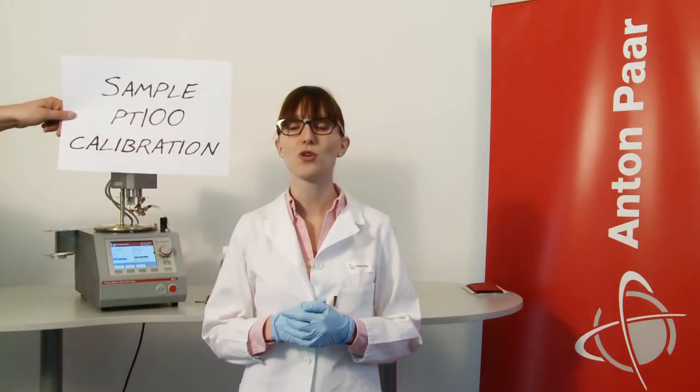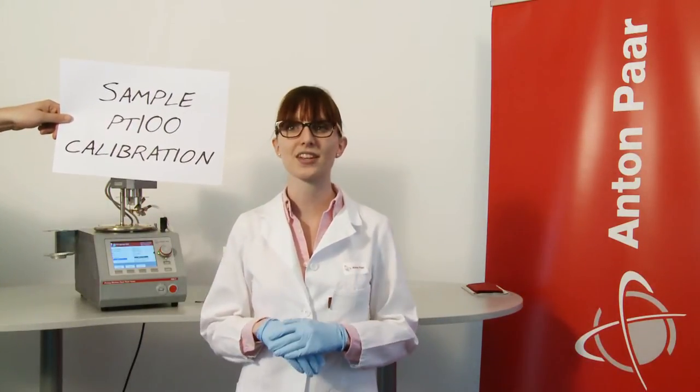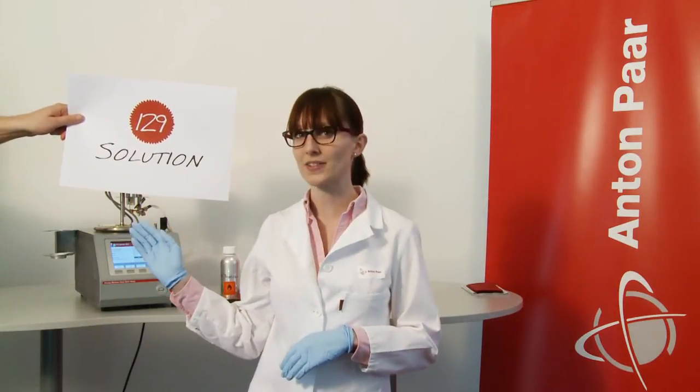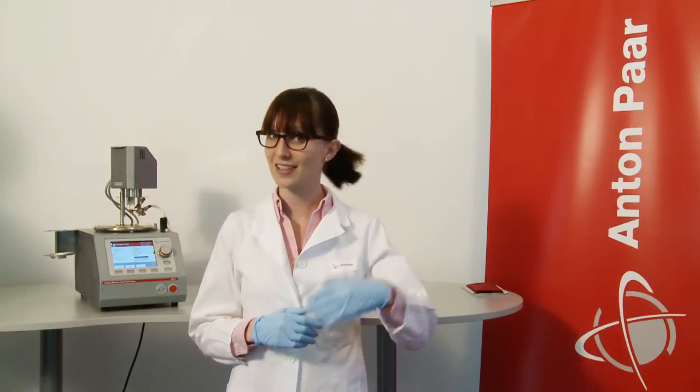This is the PMA5 Pensky-Martens Flashpoint Tester. In this video, we will not focus on the actual flashpoint test, but on the important factor of calibration. PMA5 comes with a special calibration program and accessory set for easy and precise calibration of the sample PT100, the temperature probe for your flashpoint tests. This is solution number 129 of Anton Paar's 140 solutions for petroleum testing. Let's have a look.